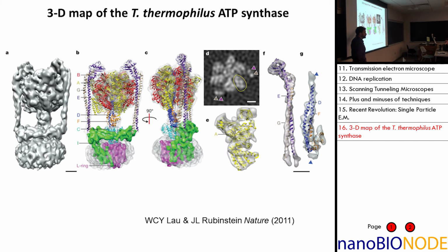They imaged, this is a single F1FO ATPase, and remember, the question is which one is FO and which one is F1, I'm not sure, but there's a stalk between them.